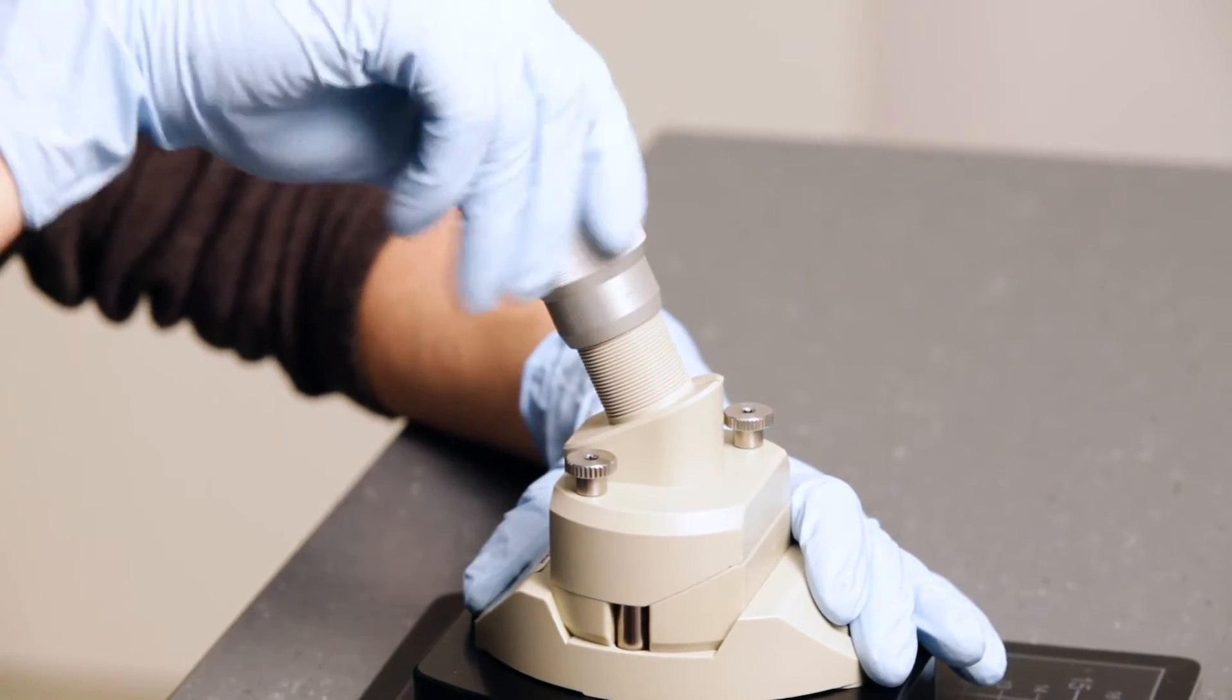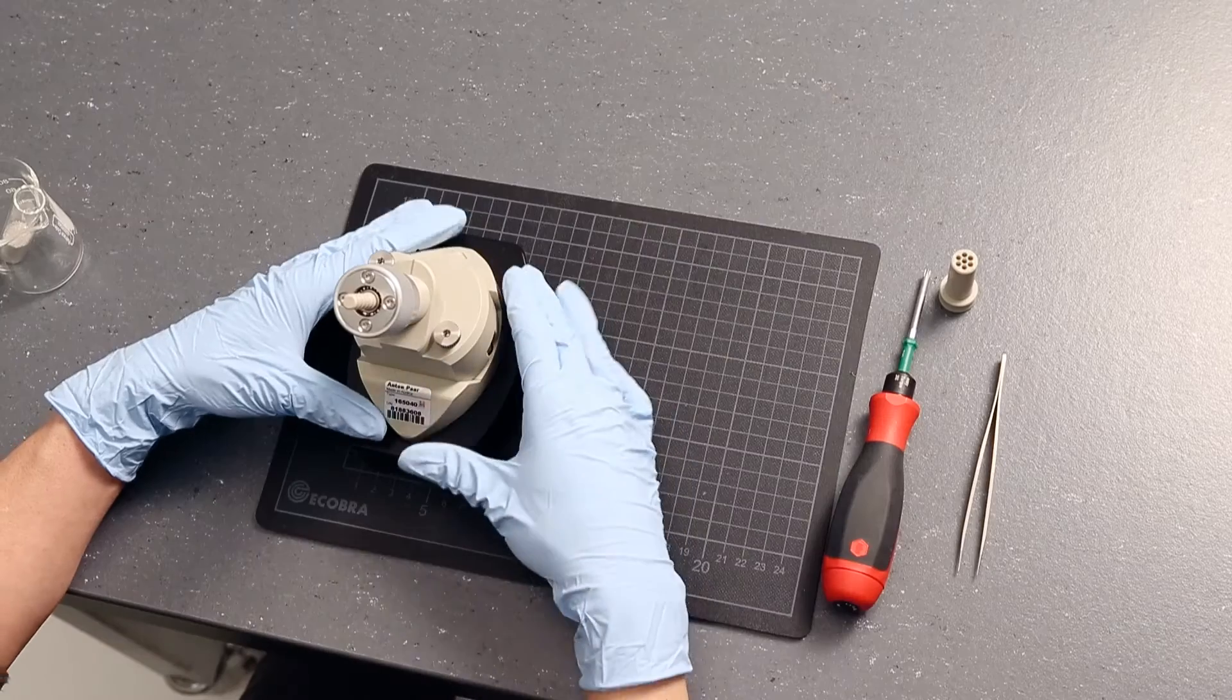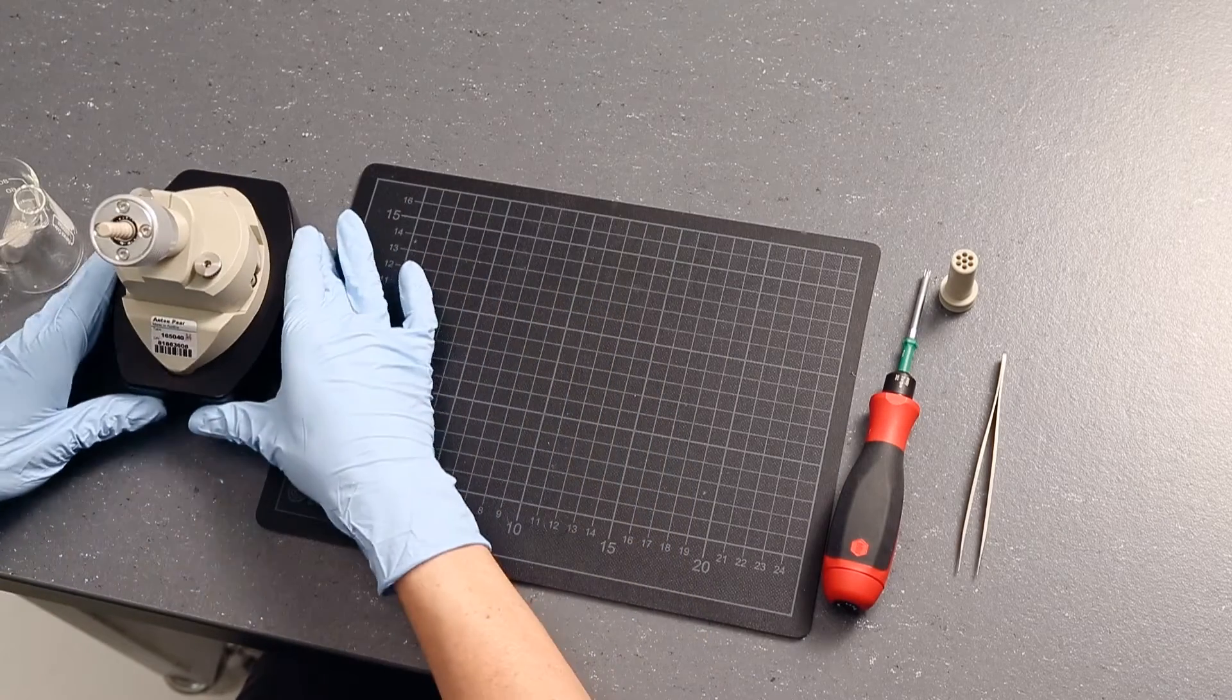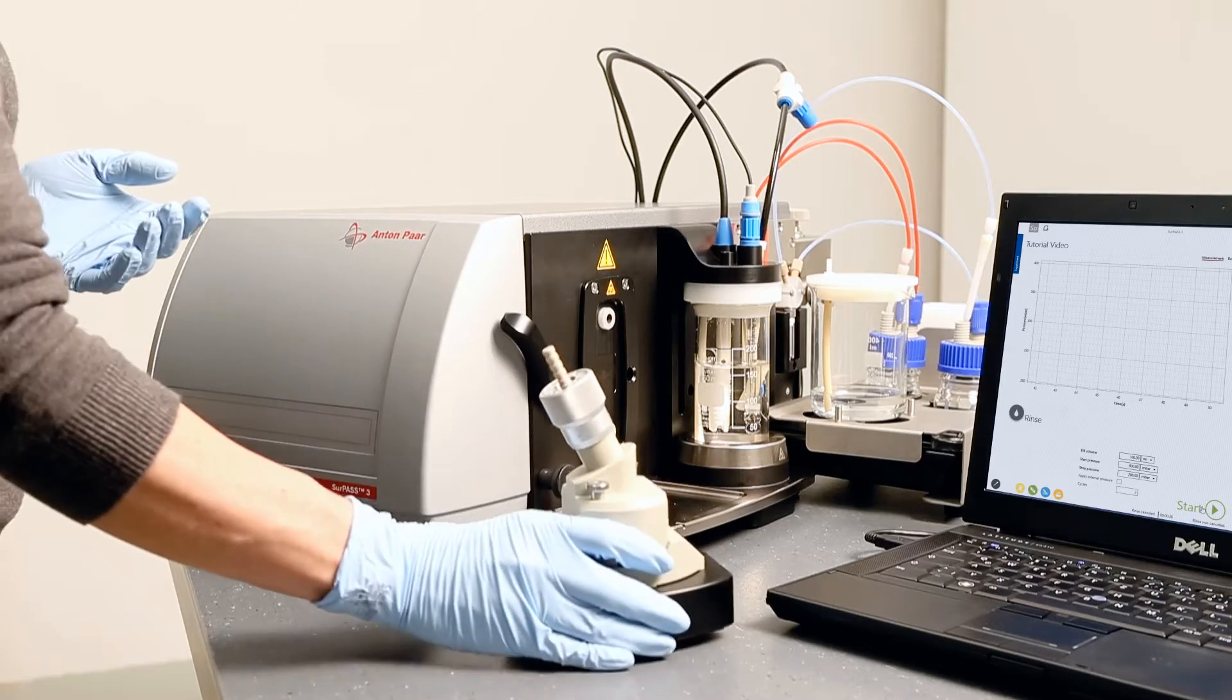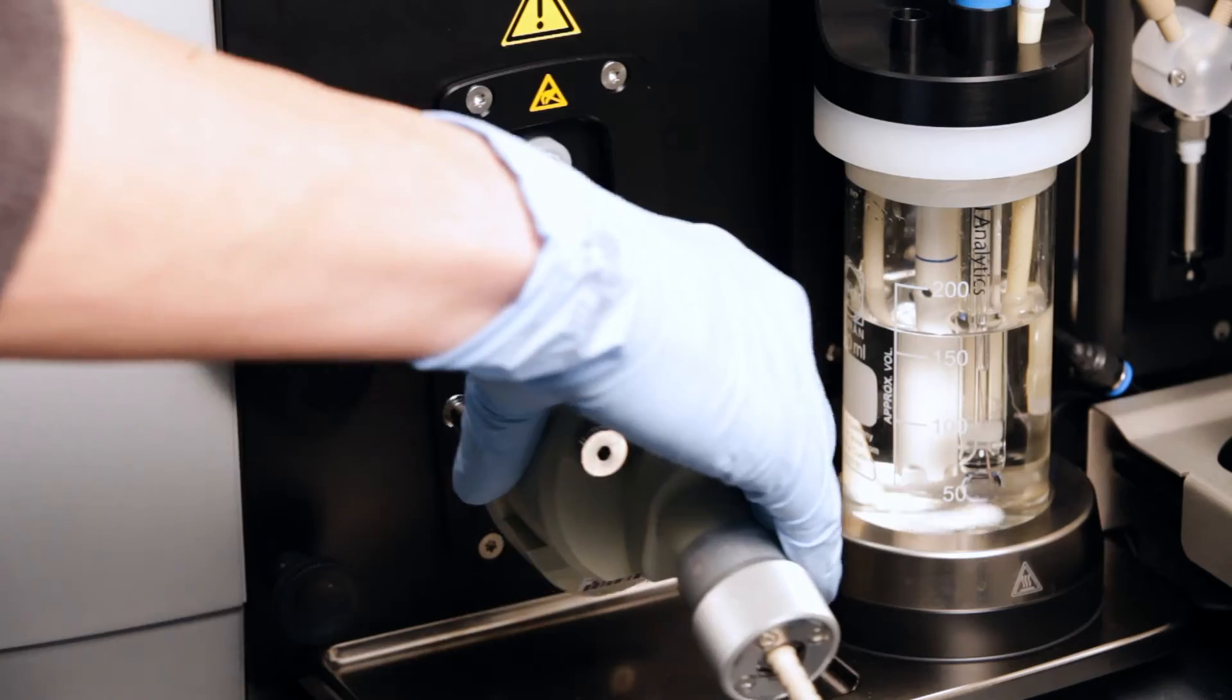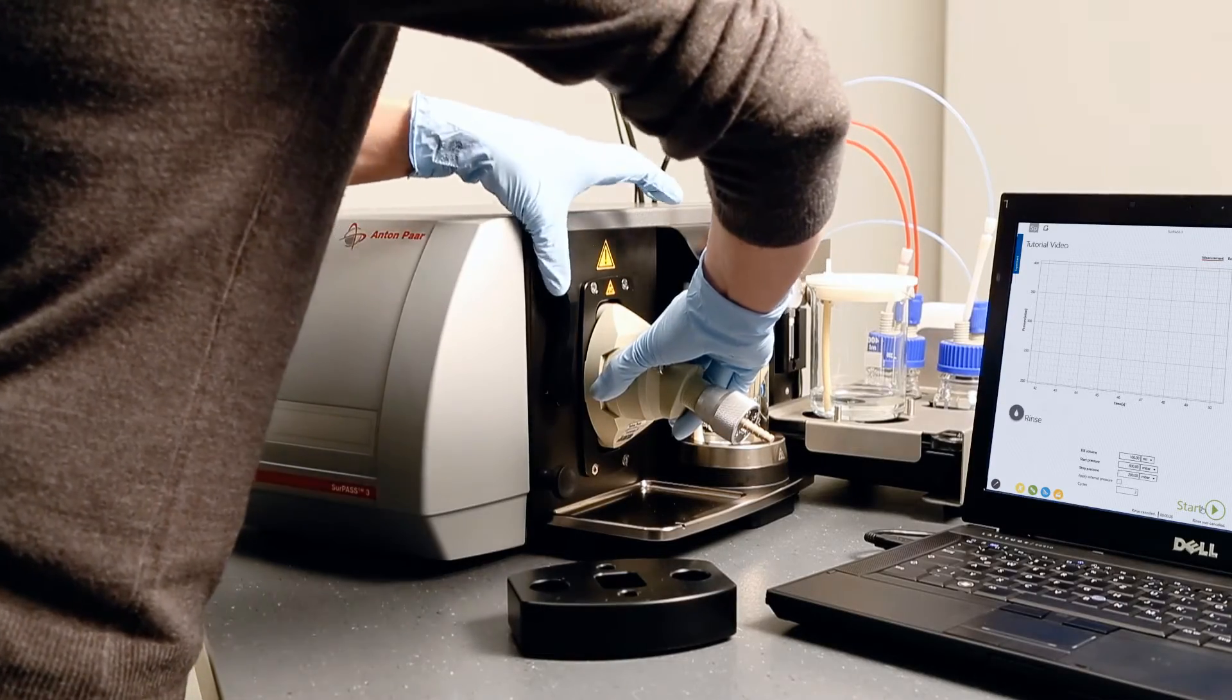Mount the adjustment knob. Now you can mount the measuring cell on the instrument. Simply plug in the cell and lock it by turning the lever to an upright position.